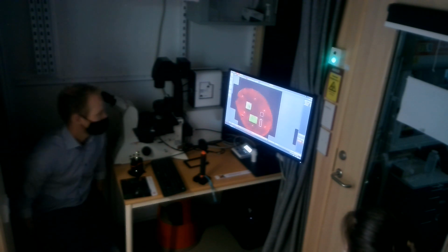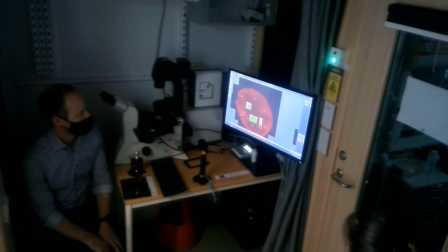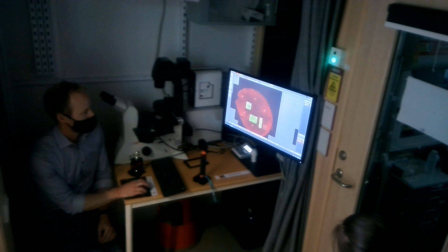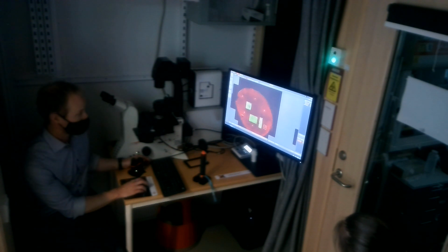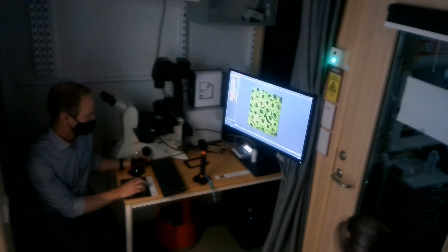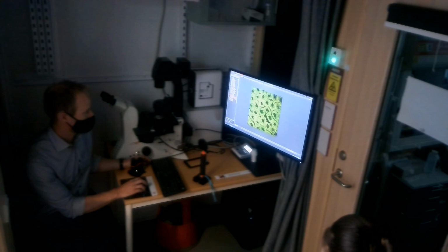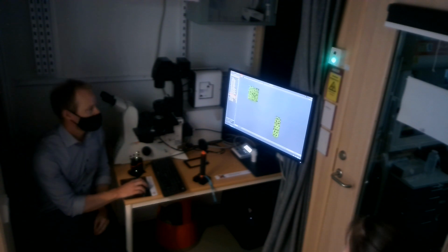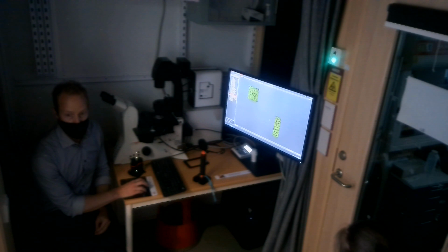Sometimes you have a tissue or a sample where there might not be a lot of interest between these two regions, but there is still some type of interest, like how they are related to each other. That would be maybe more often in a tissue or something like that. So here we have region 7 and region 8, and here we have region 7 merged, region 8 merged. But if I take these two and I mark them both, I will see the relative distance and where they were in relation to each other.